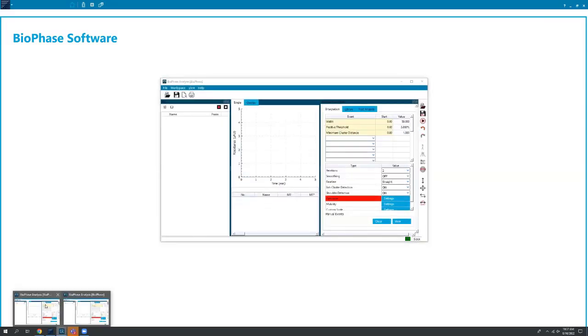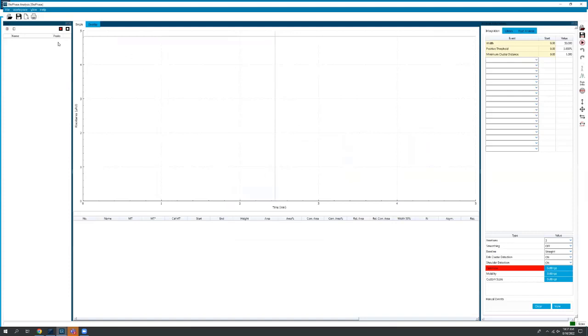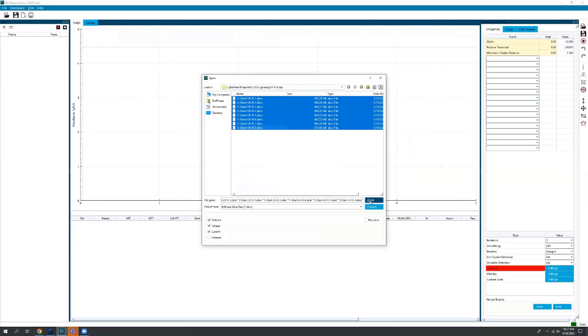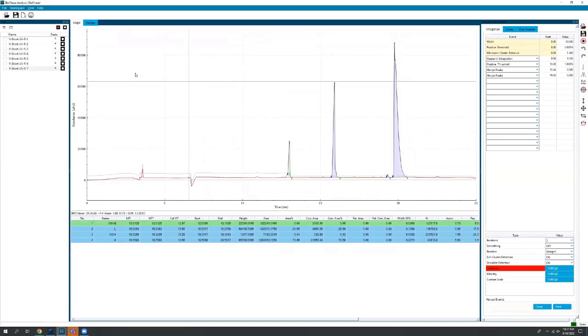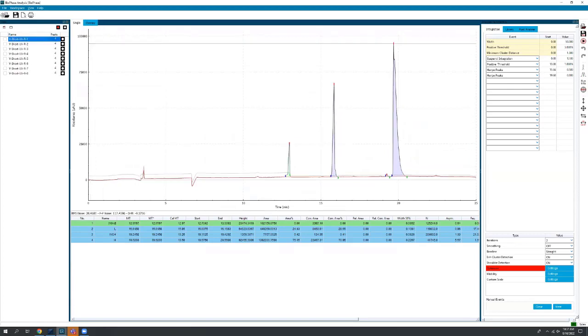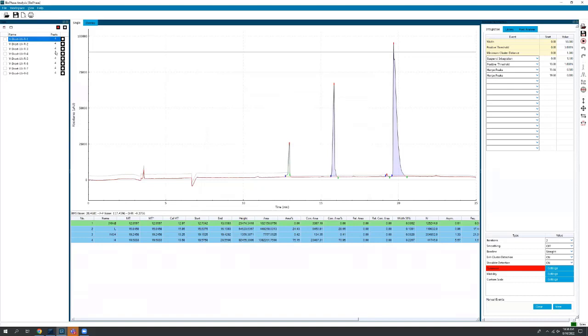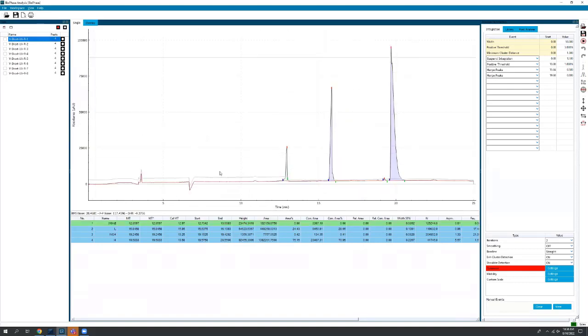So we launch this data analysis, actually. Go to this one, open that up. And we're going to look at our 8 reduced samples here. Open this up. So this is sort of how you load your samples. In your sequence file, you're going to choose a file path for those data files to be saved. And when you're ready to go and analyze that data, you can just navigate to that file path wherever you have it saved, open it up, and the BioPhase software will go ahead and analyze it or bring it up into review here. So let's see what we can do.